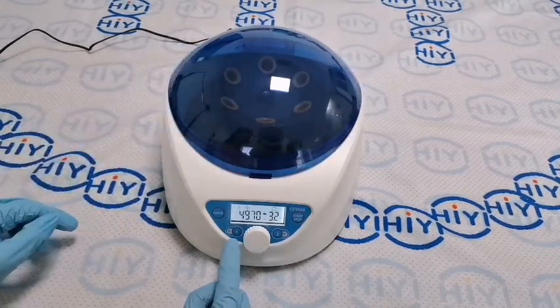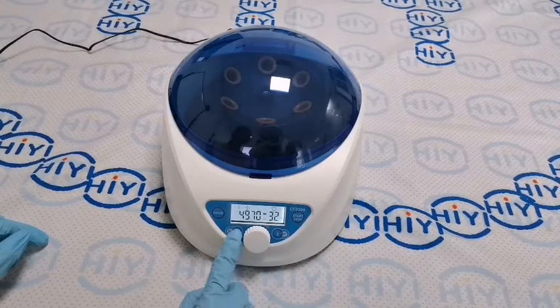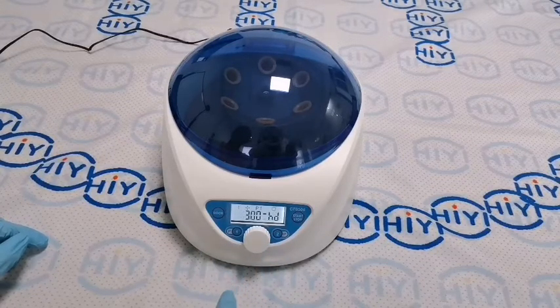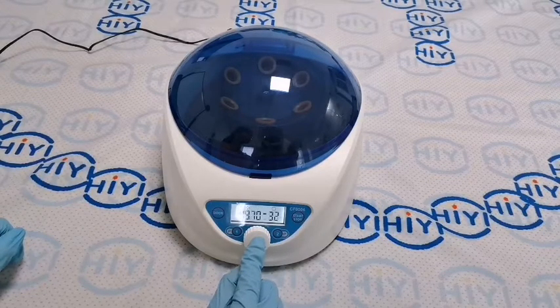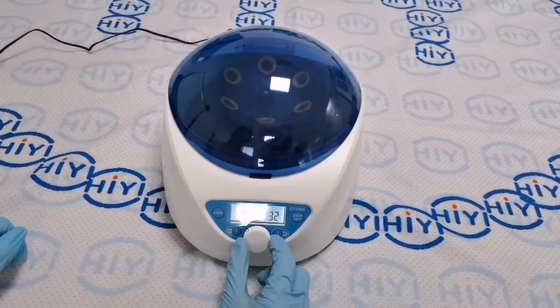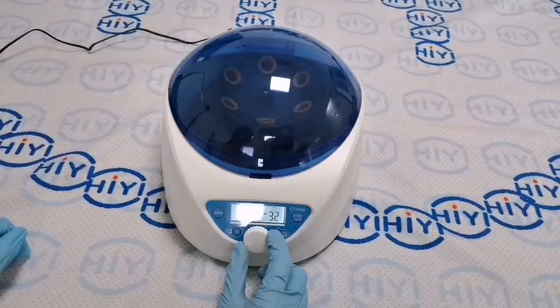The program 1 and the program 2 button — we can set in the program. Look at the white button; we can set the speed, rotation, and time.